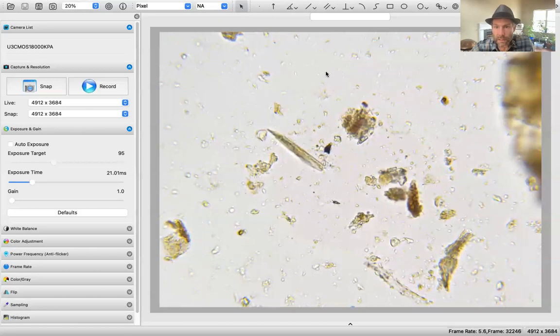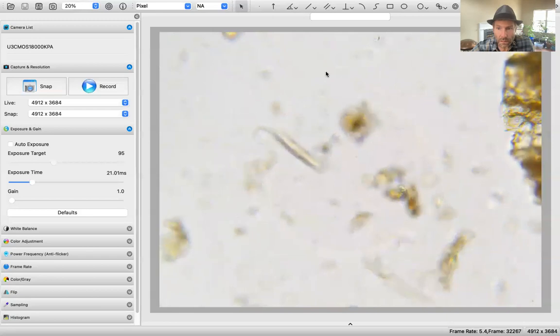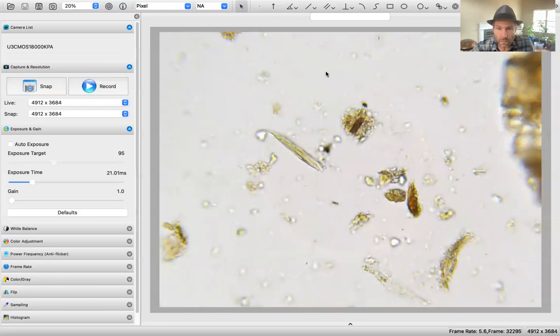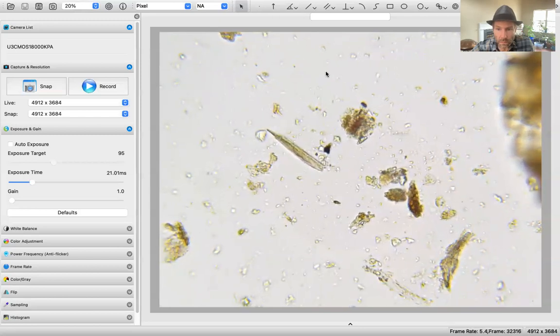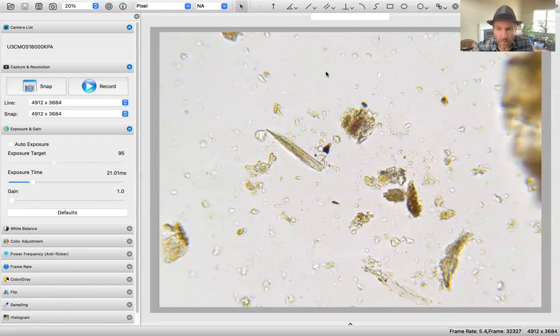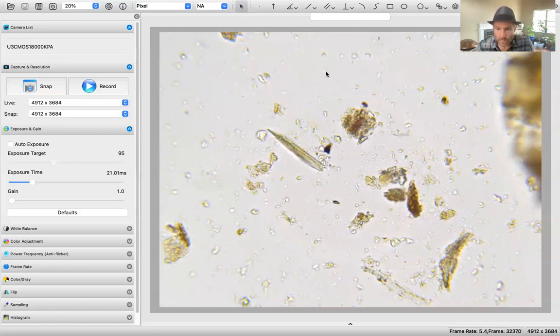Not seeing any flagellates off the top of my head. So nothing to record.